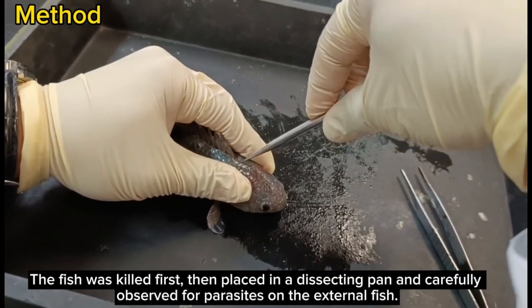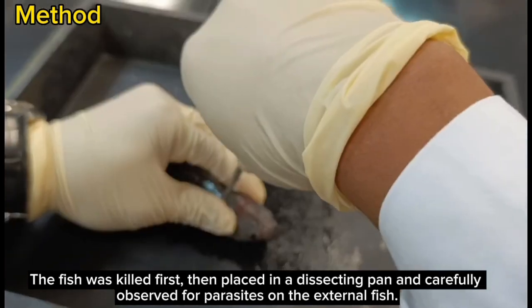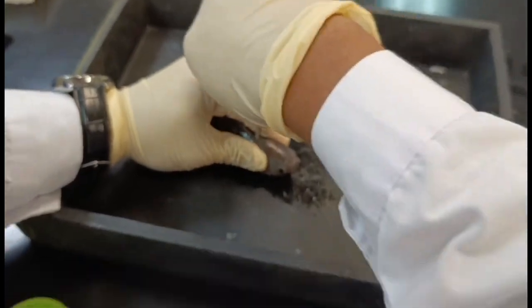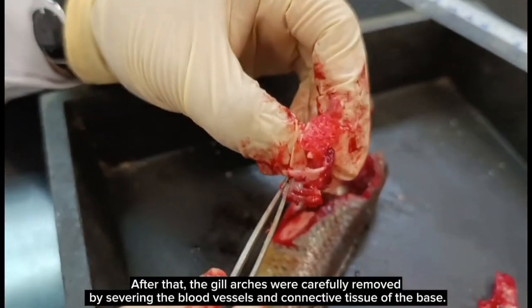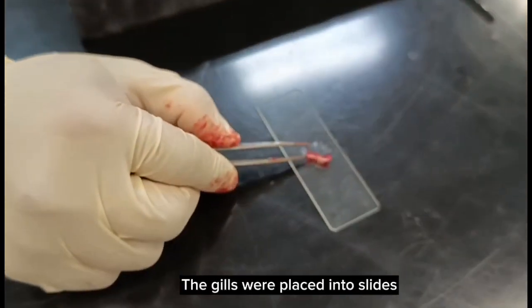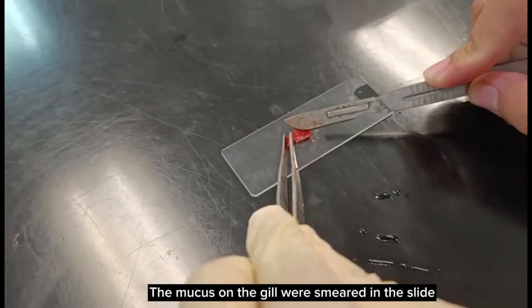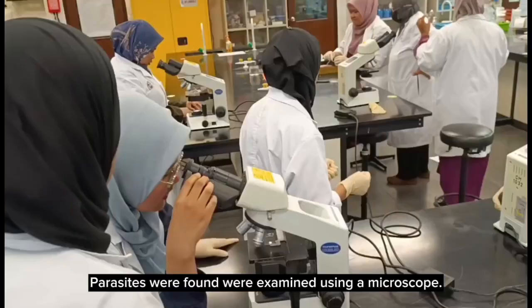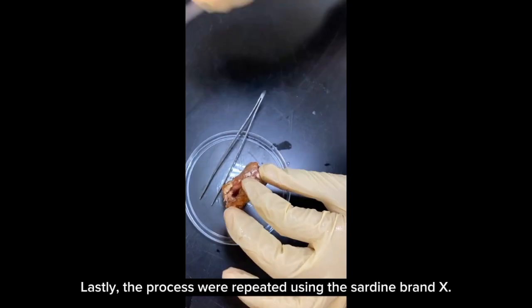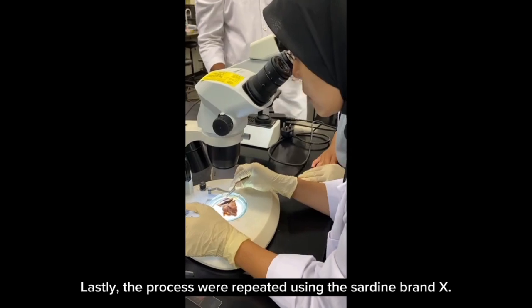Next is the methodology. The fish was killed first, then placed in a dissecting pan to observe any parasite on the external body of the fish. After that, the gills were carefully removed by severing the blood vessel, and the gills were placed onto the slide. After that, the mucus on the gill was smeared on the slide. The parasites that were found were examined using a microscope. Lastly, the process was repeated using the canned sardine.